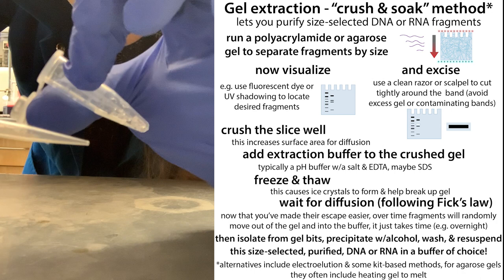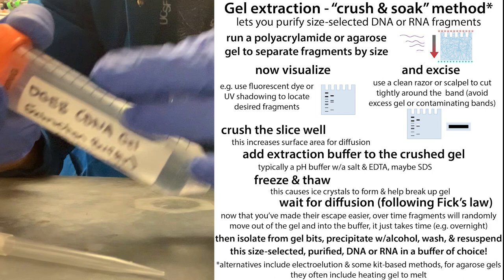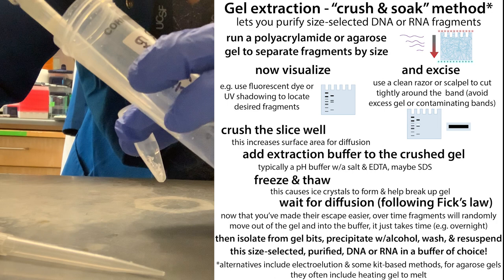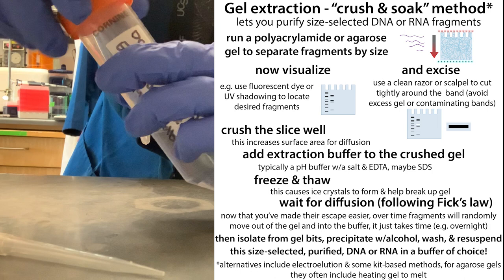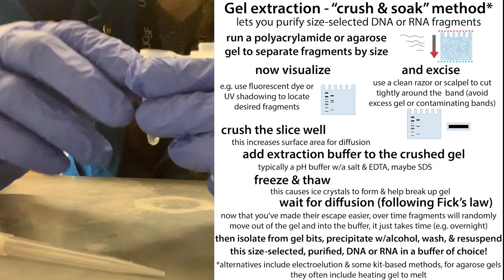Now add your gel extraction buffer — you'll have a different one depending on whether you're doing RNA or DNA extraction, and also depending on what your next step is. Typically you'll add about 400 microliters for a gel piece this size; check your protocol. When you add it, pour it down the side of the tube to make sure everything gets down and nothing is stuck up at the top where it could get stuck when you close the cap.